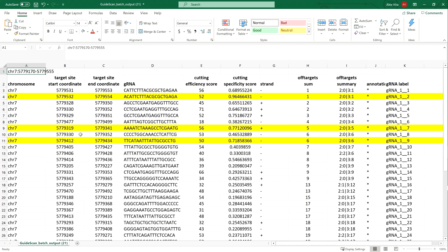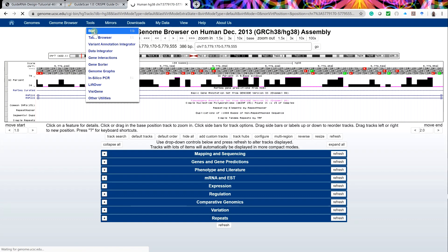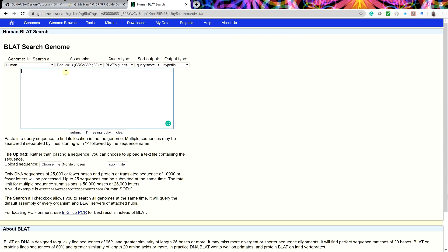Finally, the selected guide RNAs can be pasted into a custom BLAT search and displayed in our candidate cut region to confirm the absence of overlaps, SNPs, and repeats. In the genome browser, under Tools, select BLAT. In the input box, enter the labels and guide sequences using the syntax shown.